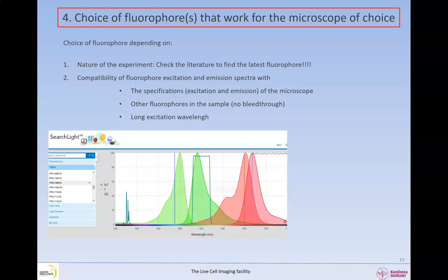On top of that, a key decision when it comes to picking the right fluorophore for your live experiment will also be determined by its optical properties. The fluorophore of your choice should have a high quantum efficiency so that it converts the absorbed light efficiently into emitted light, a large extinction coefficient to avoid high excitation powers, giving you a bright fluorophore, have good photostability, and when it comes to fluorescent proteins, be a monomer with a maturation time that should not slow down the folding of the target protein in the ER.